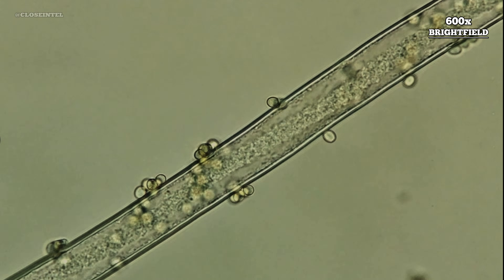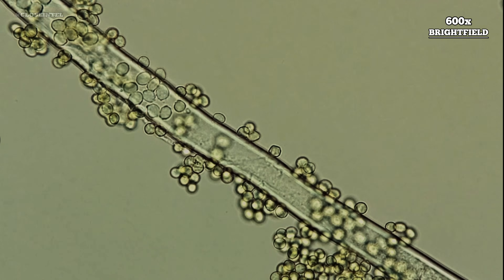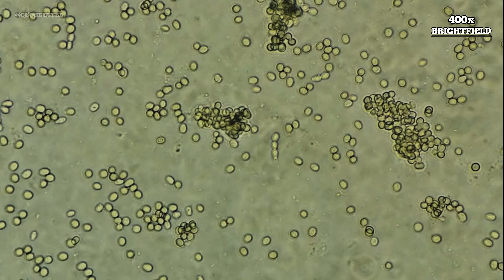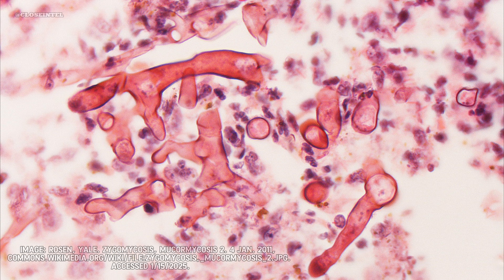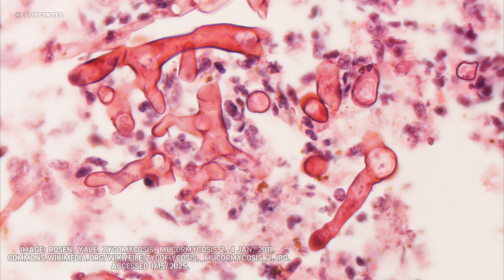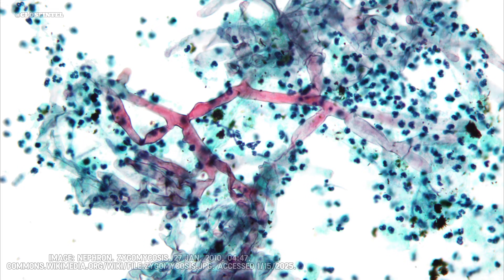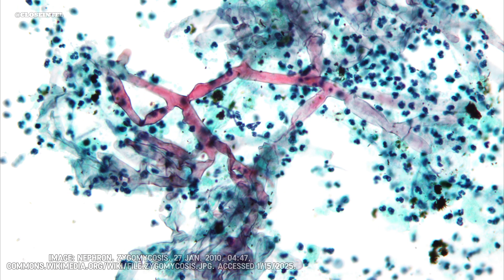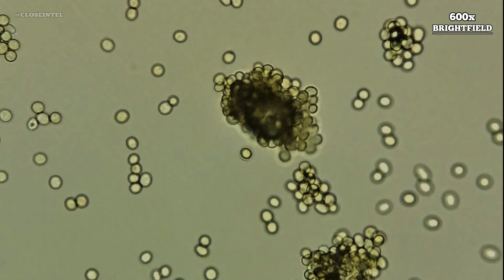I've chosen not to display images of infection due to their graphic nature, and viewer discretion is advised if you choose to look further on your own. I can, however, show you what they look like on a microscopic level — these are some images I've found online of tissue samples infected with mucormycosis. These samples under a microscope show the hyphae of the fungus inside various tissues as red branching structures, with colors coming from staining methods that highlight fungal elements and biological cells more clearly.